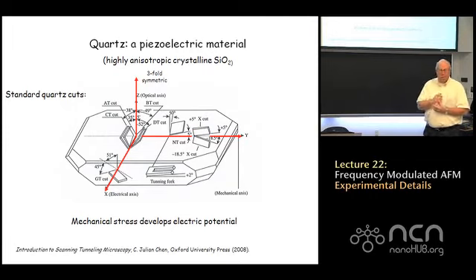So piezoelectricity, if you don't have a material science background, means that if you push on the quartz, charges develop on the surface of the quartz due to the mechanical stress that you impose, right? And so it's a way of coupling mechanical forces to electricity.